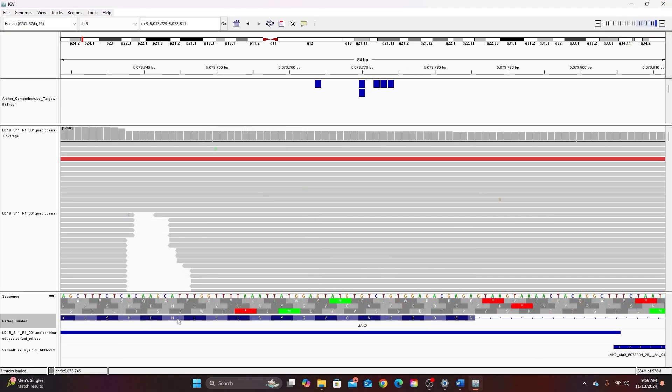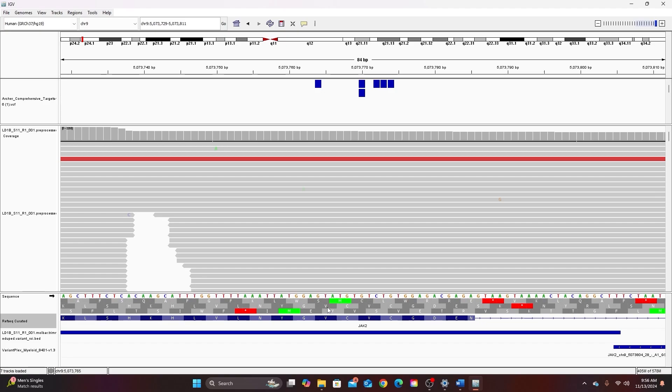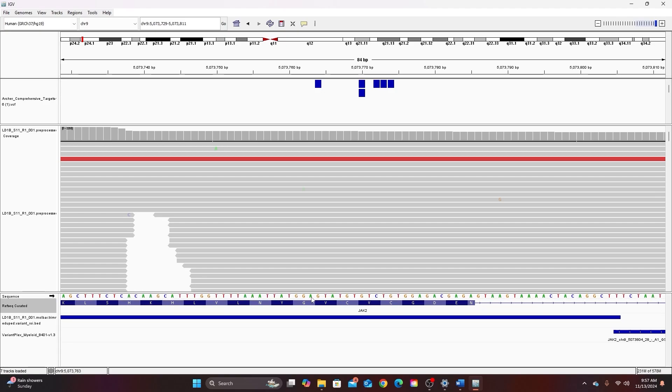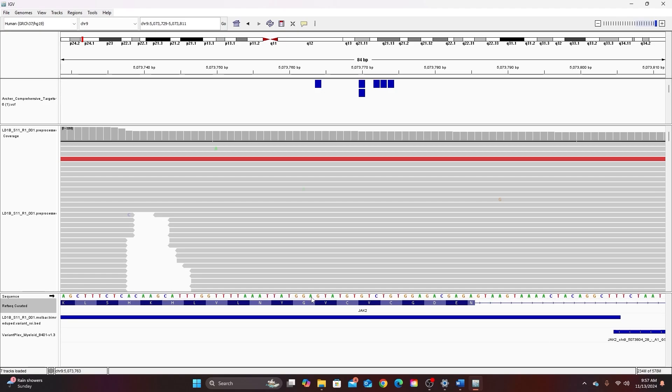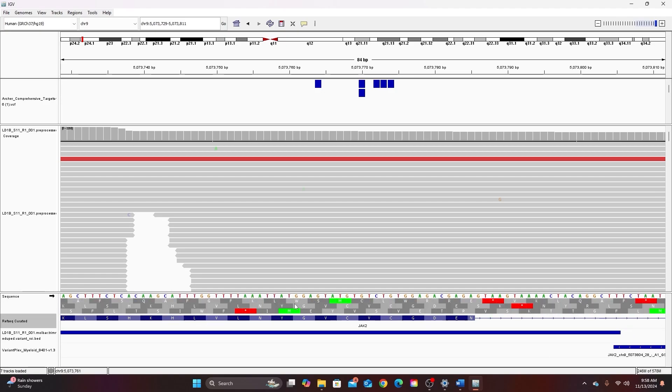So I mentioned that the reference genome when you're zoomed in shows you the translation or the amino acid sequence of the gene. You can see here in gray there are alternative transcripts and this can help you identify the consequence of a frameshift mutation. So each of these is framing codons differently. Left clicking on the nucleic acid sequence will show or hide the frameshift translations for the forward strand.